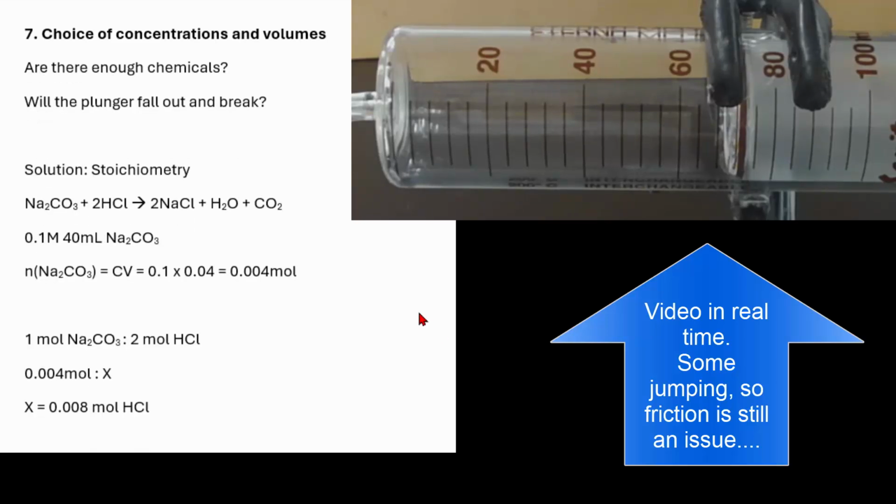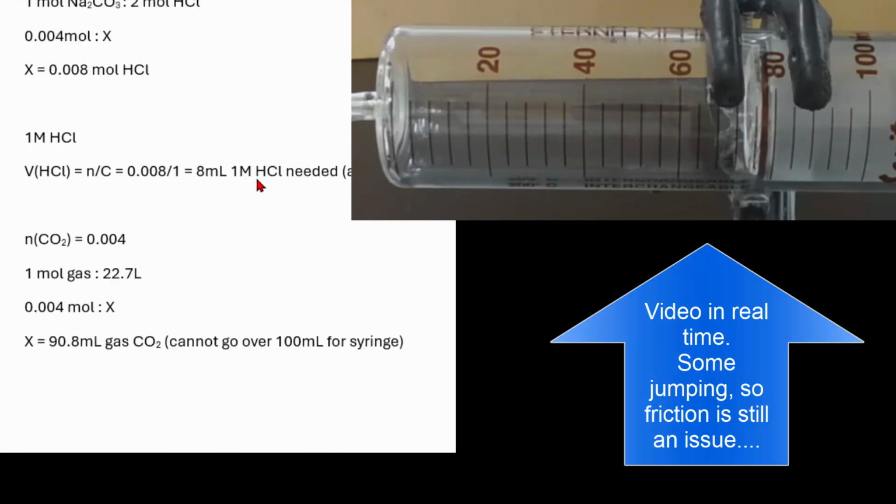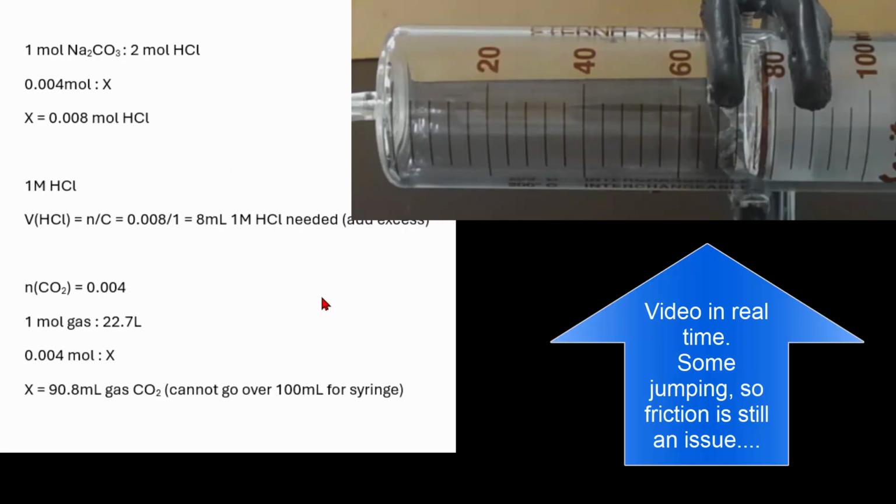All right, so concentrations and volumes, there has to be enough chemical. You've got to have an excess of the acid. If you're looking for the effect on the sodium carbonate, I think I've said calcium carbonate throughout this video, but anyway, if you're looking for the effect on the sodium carbonate, you've got to have an excess of acid. So you've got to make sure you've got an excess of that. You also can't let the plunger fall out and break, so you can't go over 100 mils. So even though it's really slow and it takes a long time to get there.